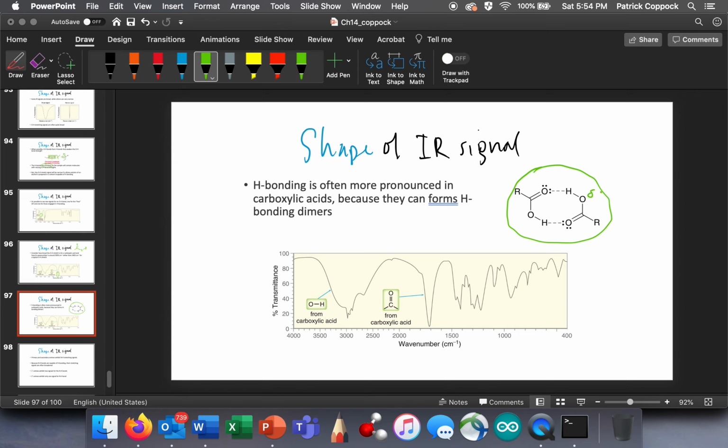You've got your partial negative, partial positive, partial negative, and then there's a hydrogen bond right there. Since it's so close, the other one is like a tether, like they're chained together. Then we have this plus and this minus over here, and they go, while those guys are dancing, we might as well dance. So this is a much less transient hydrogen bond, and consequently it's going to bring the whole peak upfield.